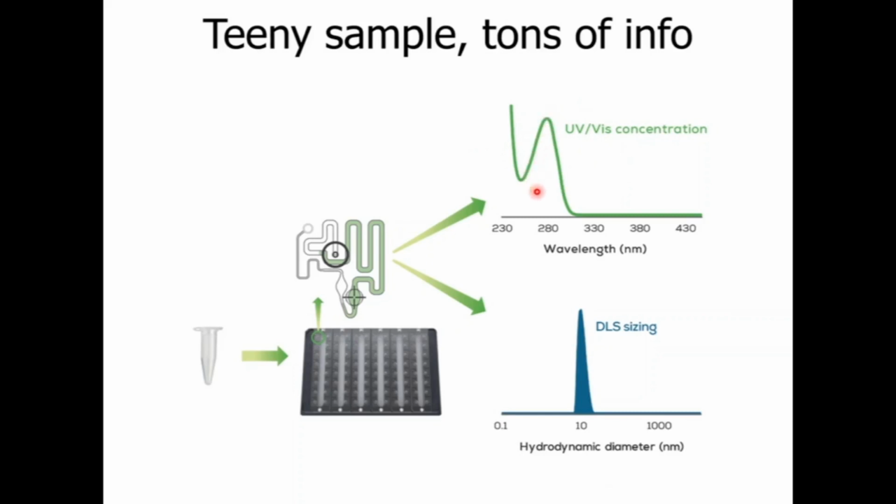In addition to the UV-Vis signal, we can also look at DLS, the dynamic light scattering. This yields information about the hydrodynamic size and also the heterogeneity of our sample. Our protein here is about 10 nanometers in diameter, so it's quite possibly an IgG-type molecule. The size distribution we're observing is nicely sharp and narrow, suggesting a homogeneous prep without any aggregates.